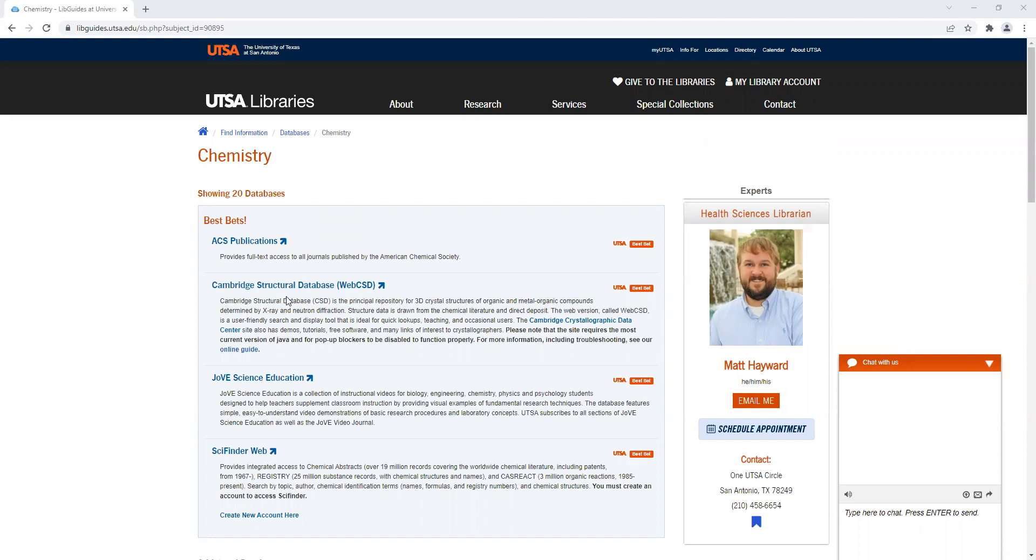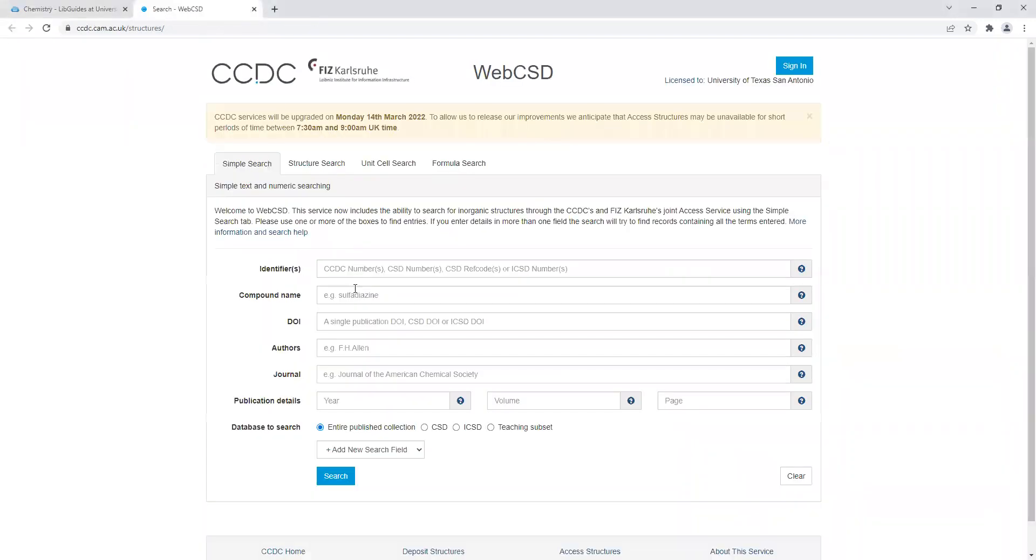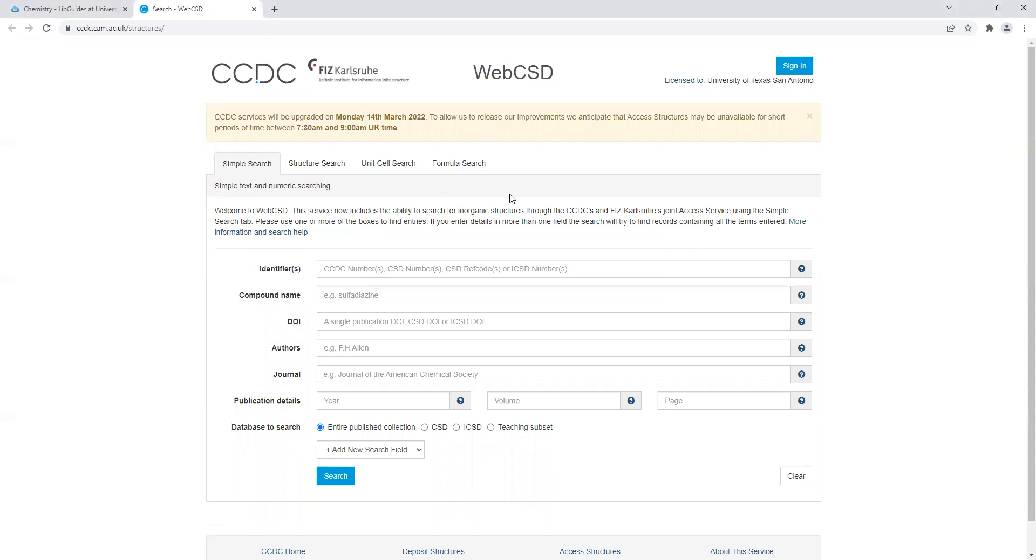This is the Cambridge Structural Database, commonly referred to as Web CSD. Do keep in mind if you're off campus you may have to log in with your UTSA credentials. It'll bring you to this page where we do a simple search. Simple searches involve a compound name, author name, or later in the semester when we look at ref codes, you would do a simple search to research that.